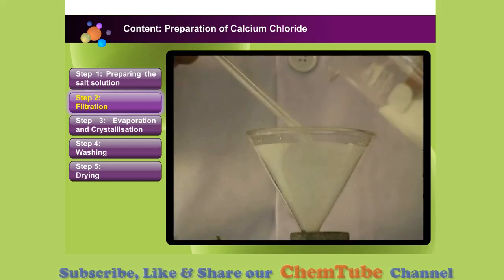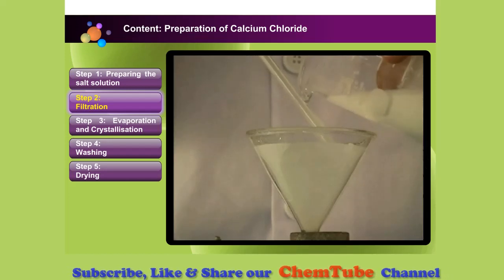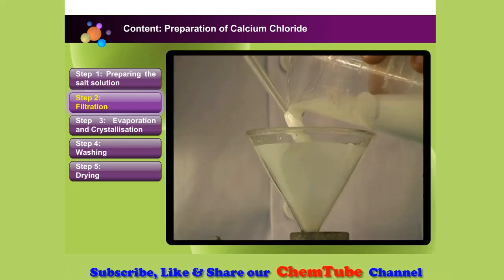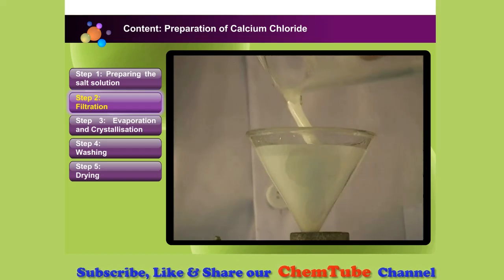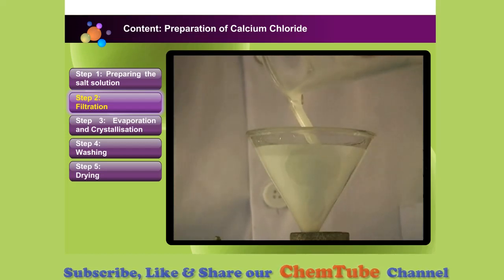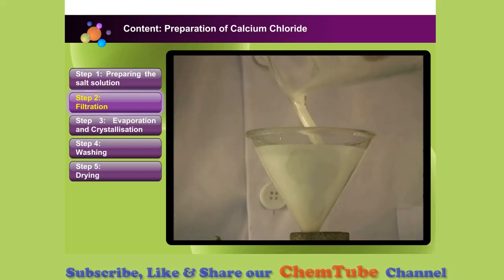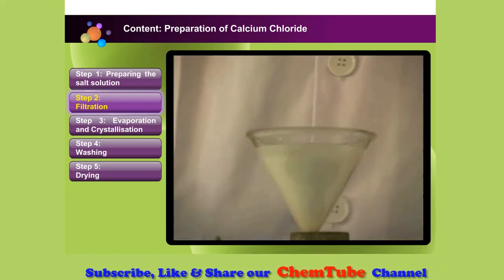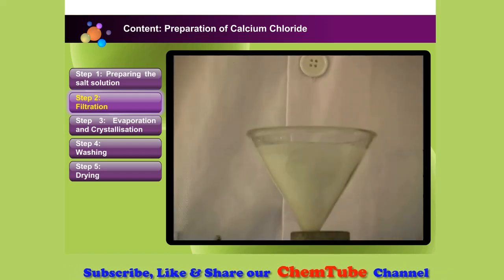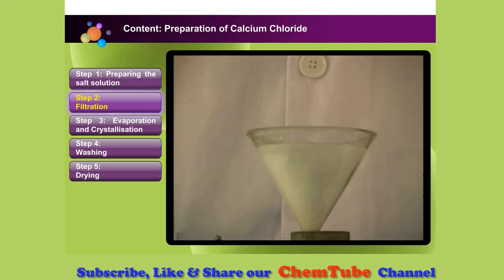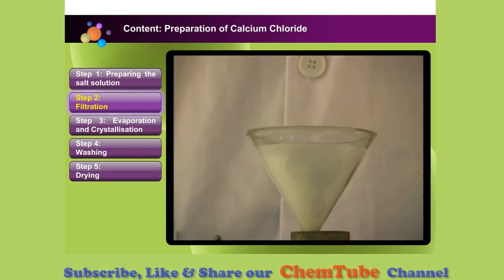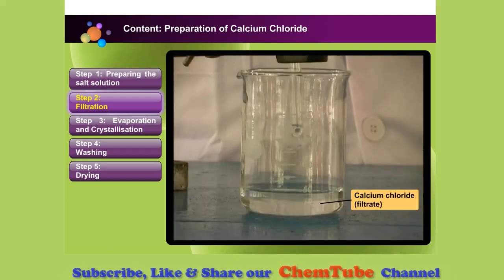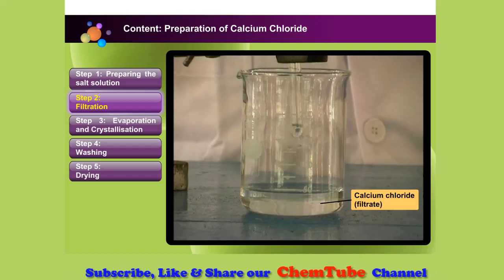First, filter the mixture to remove excess calcium carbonate powder. Leave the excess calcium carbonate powder on the filter paper. The filtrate — calcium chloride solution — is collected in the beaker.